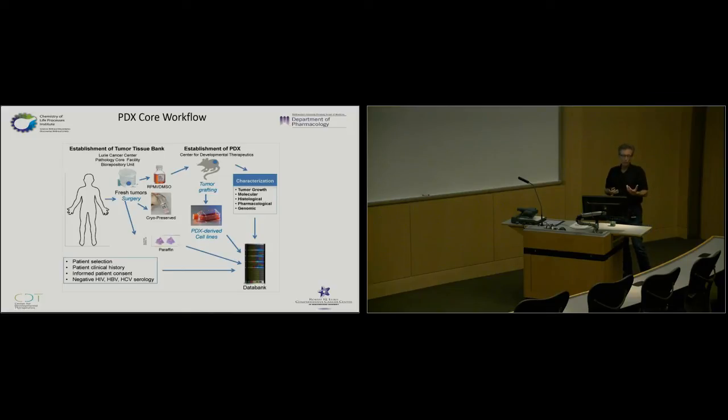And so what we typically will do, as part of a procedure that doesn't even require an OR, is just get the drainage, which can be as much as several liters of fluid, and you spin that down. Those are really highly metastatic, highly drug-resistant tumor cells. They grow like crazy in mice, and interestingly, histologically, even though those are metastatic cells, if you go back to the patient's tumor from 5 to 10 years ago at the original diagnosis for a breast cancer patient, it looks very similar to that. I'll show you one example of that.